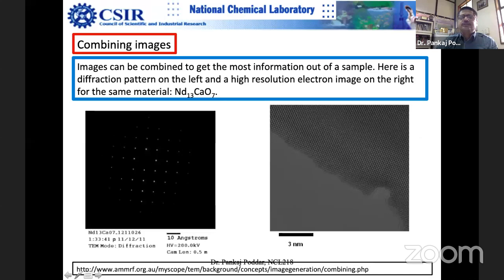You can see that this is taken from the interference of the direct beam and the diffracted beam. When you have the direct beam and the diffracted beam interfering, then you have this. This is basically an interference pattern, right? Twice a Fourier transform. So what students do, they have not taken the selected area electron diffraction, so they will just do one more Fourier transform, they will get this, or they will do the Fourier transform of this, then you can get something like this, right?